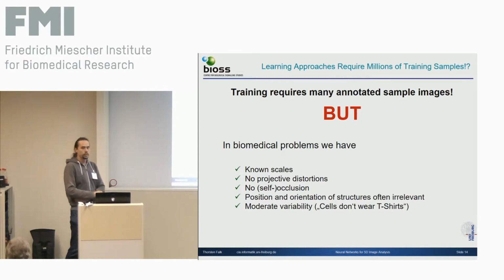But if it is really complicated and if you have a large data set, that's the other requirement. If you don't have a large data set and it is easy to annotate everything you have, then annotate it manually. But if you want to process millions of images and want to maybe annotate only 10 or 12 or 20, then networks are what you want.